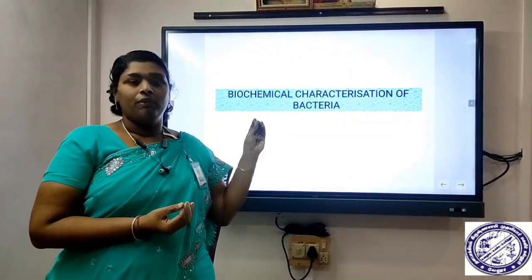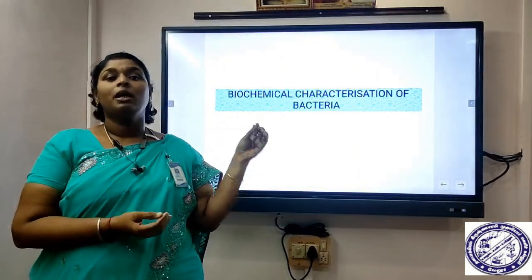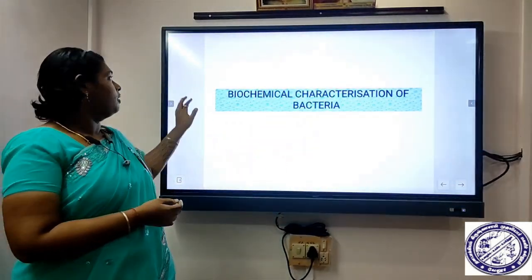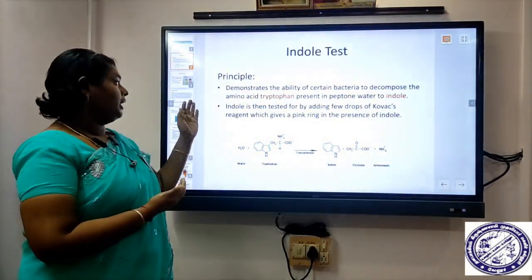And so today we are going to see how we are able to characterize an organism using their biochemical properties. So the common biochemical characterization we are going to see today. The first test we are going to see is the indole test.